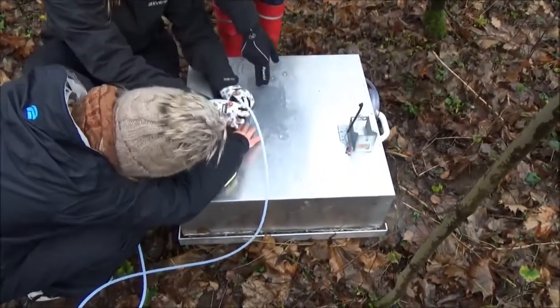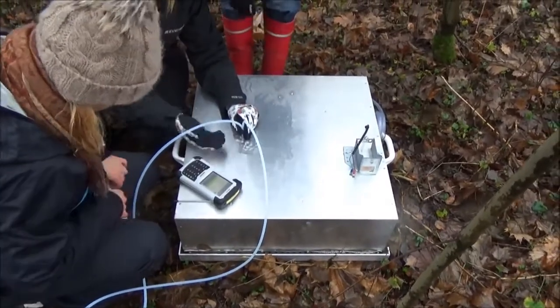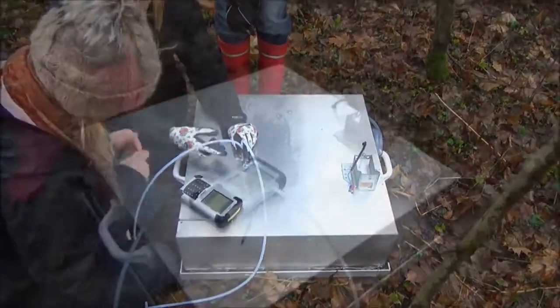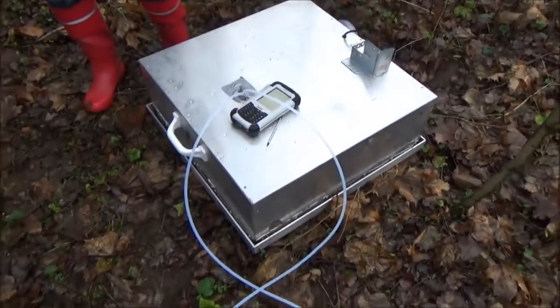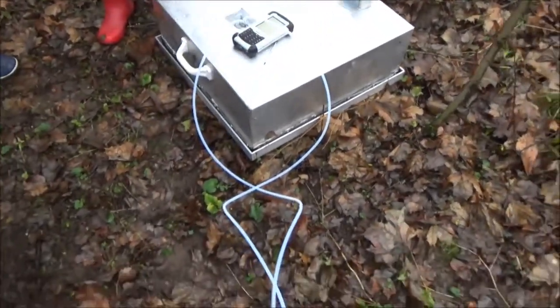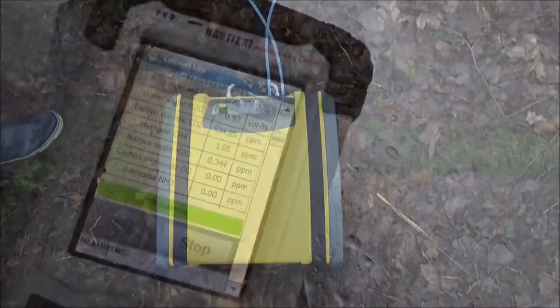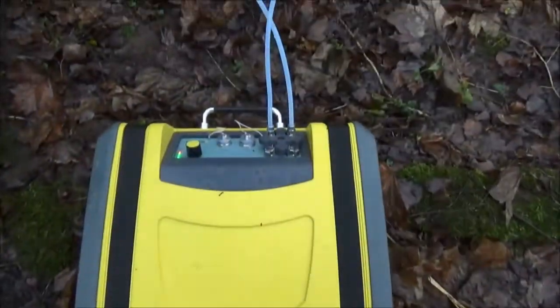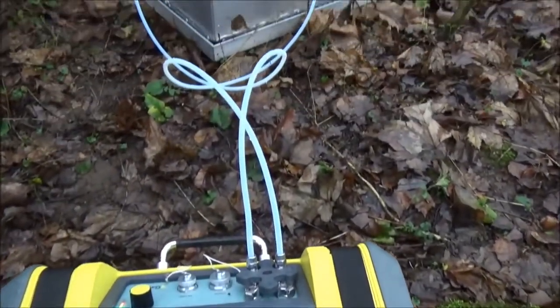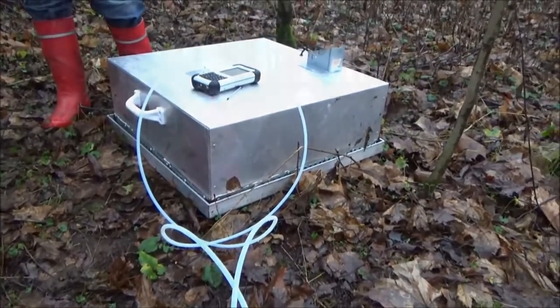The gas analyzer and the soil chamber formed a closed-loop system, in which the gas sample was circulated through the analyzer and then back to the chamber. In a closed-loop system like this, the gas concentrations increase over time. With access to online results, the operator can react flexibly to any unexpected situations during measurements, giving researchers the ability and freedom to modify their experimental design whenever required.